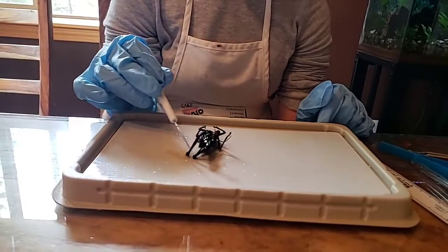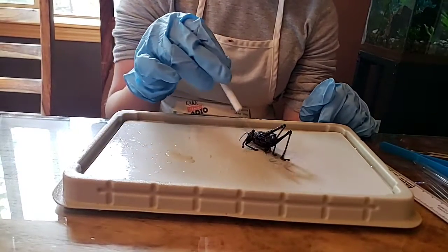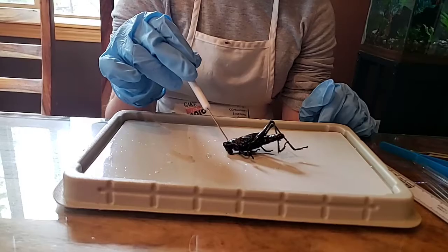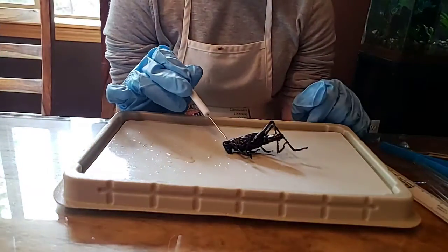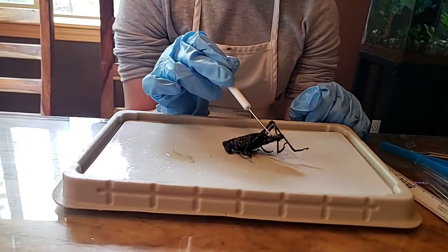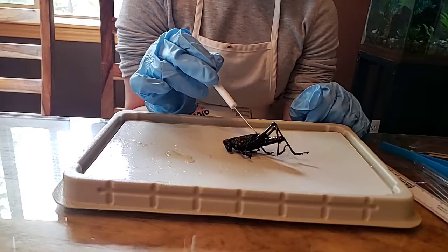Please point to the head. Turn it sideways, Taylor, so we can see where it is. Hold on. All right, so please point to the head. Lanston. Right there. Thank you for helping. Okay, the abdomen. Right there. Excellent. And then the thorax. Right there. I mixed it up so you guys would make sure you're pointing the right things.